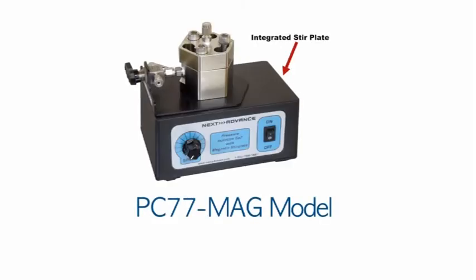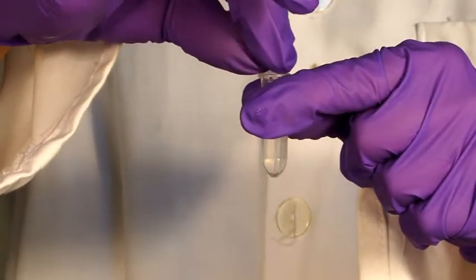If you are using the PC77 MAG model pressure injection cell with the integrated stir plate, or if you are using the pressure cell on top of your own stir plate, place the stir bar into the liquid prior to replacing the top.